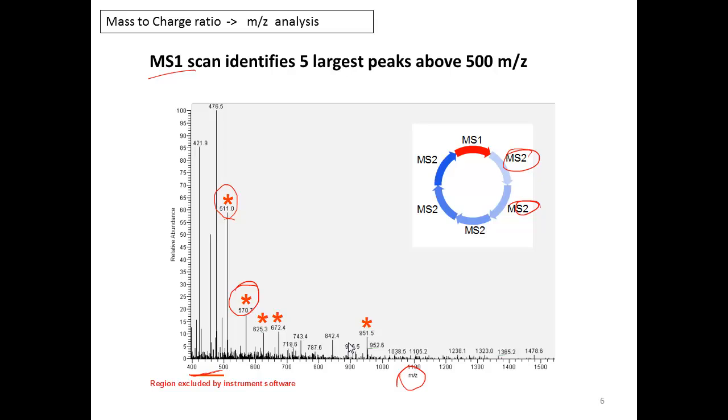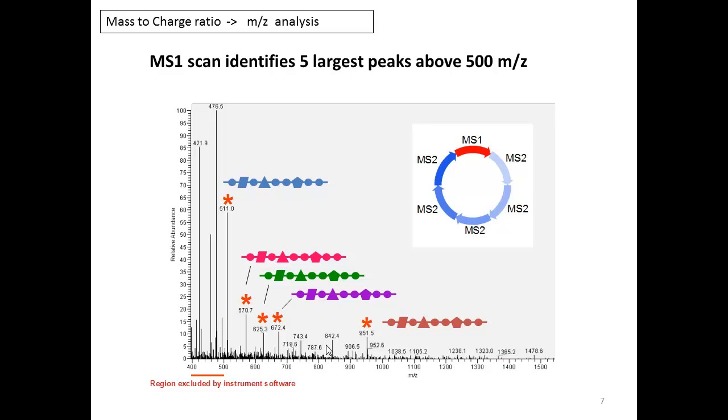And this is why it's called tandem mass spectrometry, because again you're doing 2 different types of scans, or sometimes it's called LC-MS-MS. The first MS stands for MS1, the second MS stands for an MS2. And this slide emphasizes that these peaks could be anything. We hope they're different peptides that are eluting at the same time off the column, but they could be any charged particles, and there's also a lot of electrical noise here.